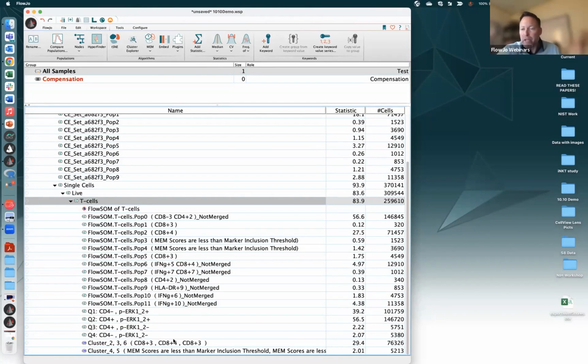But if you had a bunch of clusters, 25, 30 clusters, whatever, you may not want to walk through one at a time and try to determine which one should be merged. So I think that's a nice way to potentially simplify if you've maybe let the first pass of clustering be pretty broad, make a lot of clusters, see what makes sense, and then use MEM to put them together. Reasonable choice.